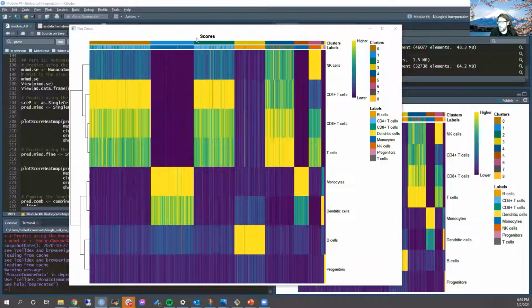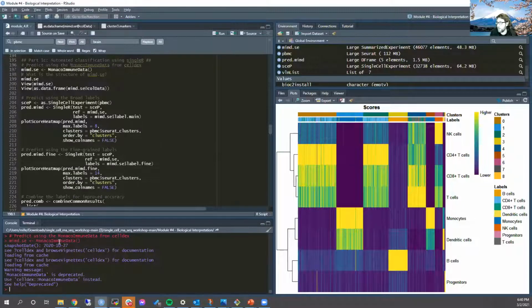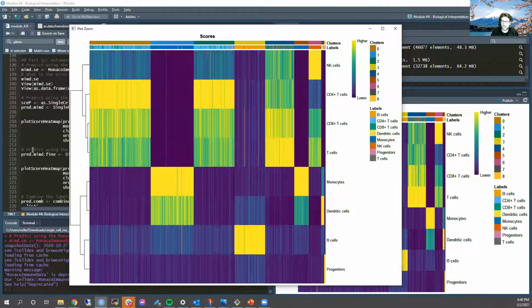The reason I was saying that he has an older version of Bioconductor is because when I run this function, it says snapshot date is 10/27, which means we're probably on different versions of Bioconductor. But apparently the fix is to restart your R session. Sorry about that, I know that's super annoying, but hey, you got a fix though.